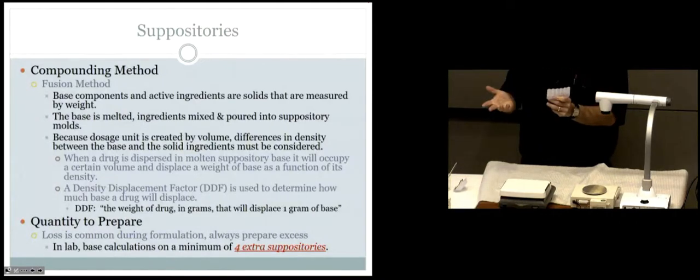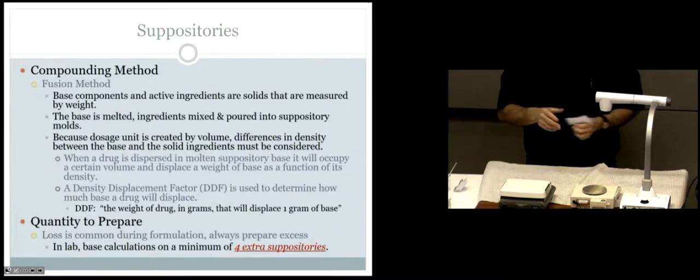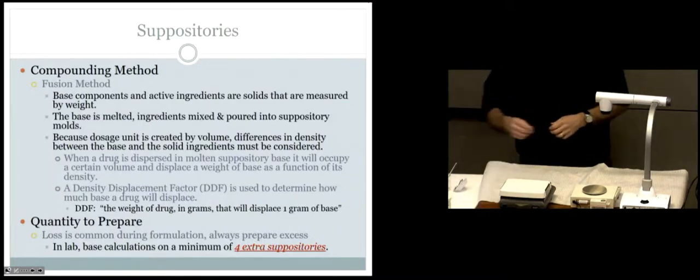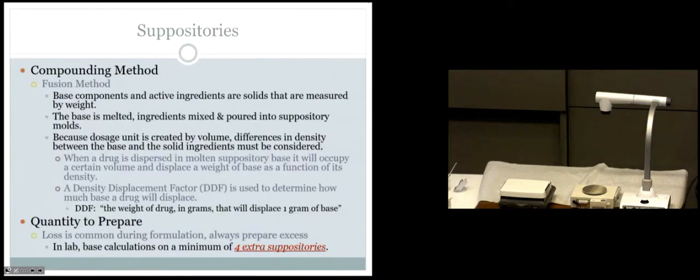Spill out. Would you agree? It has a fixed volume. If I put drug in, base will come out. An equal amount of what? Whatever amount of drug I put in, I will displace an equal volume, not necessarily an equal weight. And that's why we have to take into consideration the differences in density between the drug we're putting in and the base that's coming out. We displace equal volumes, but we are measuring things by weight, not volume. So that's why we have to use this density displacement factor.